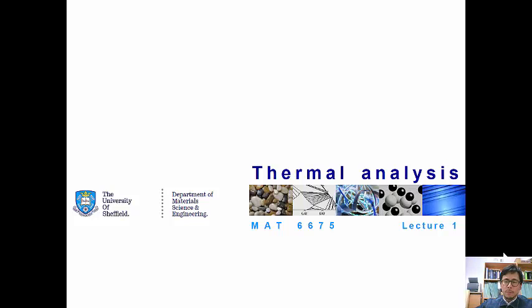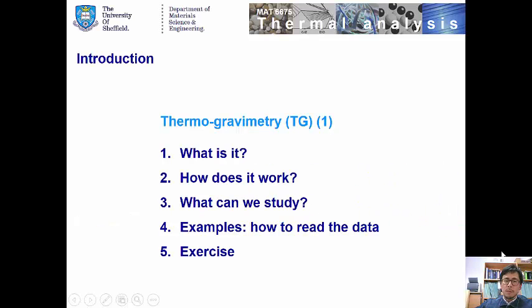Let's start lecture 1. In this lecture, we are going to study thermogravimetry, also called TG. Firstly, we're going to study what it is, how it works, and what kind of things we can study. And I'll show you some examples, and also at the end we will have an exercise.